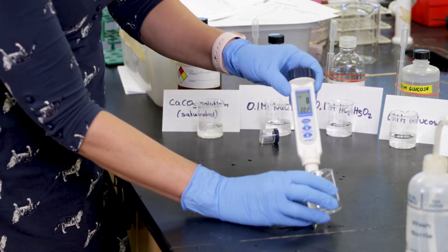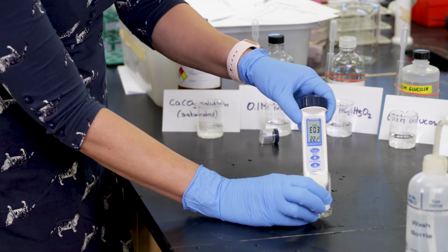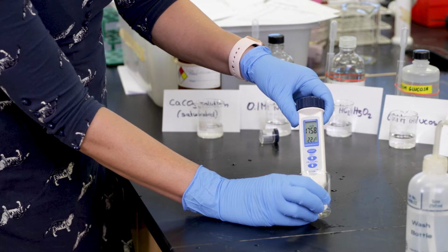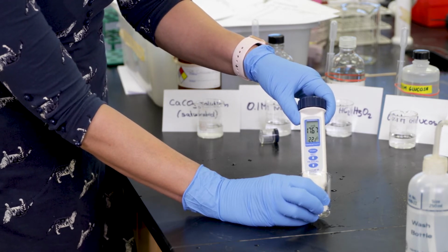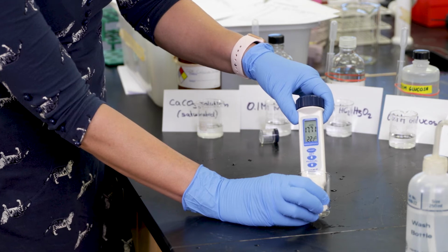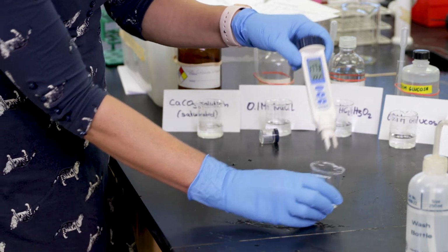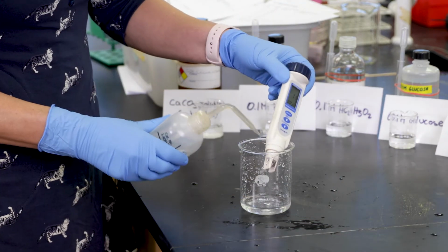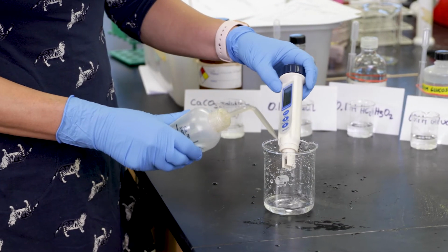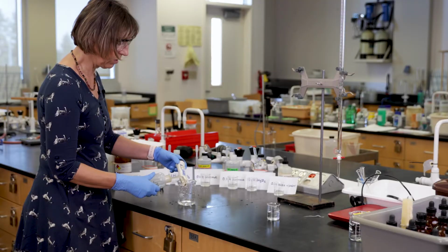If you dip that one in here, oh, it's pretty high. It's at 17.65 millisiemens. So all those solutions had the same concentration of solute, but the difference is in conductivity.